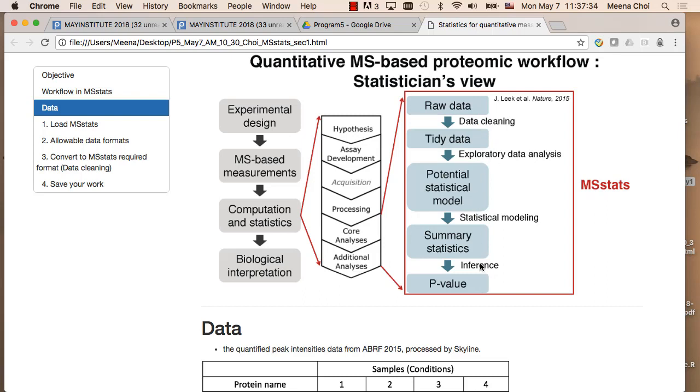So if I go back to the iPRG data that Olga showed this morning, when I evaluate the multiple results, we can see some grouping in their performance. Some groups are always better than the other groups. Probably they are not doing different statistics, they are doing different methods of data cleaning. If they started from the same data set, whatever different statistic they use, maybe they could get some similar result.